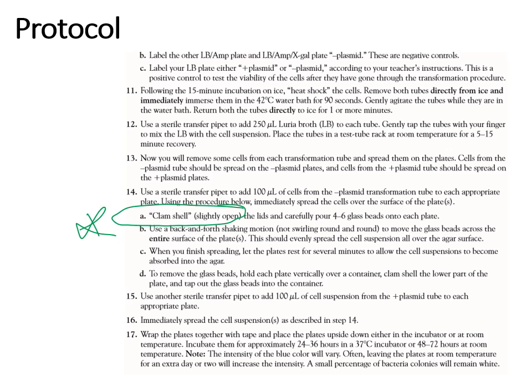You don't ever separate the cover and leave it on the bench or anything, because those agar plates, for instance, the LB plate that you're going to streak, that's meant for growing bacteria. And there's bacteria all over the room, in the air, on your hands, on your gloves, coming out of your mouth. Now that you've lived through a pandemic, you understand this regarding bacteria, viruses, fungi, all of the microbes.